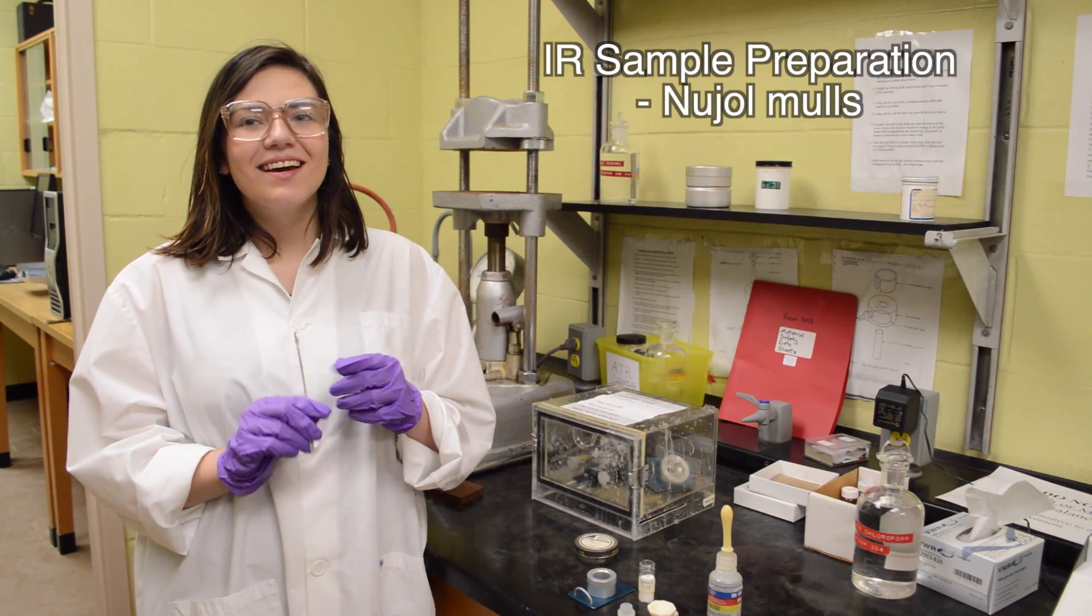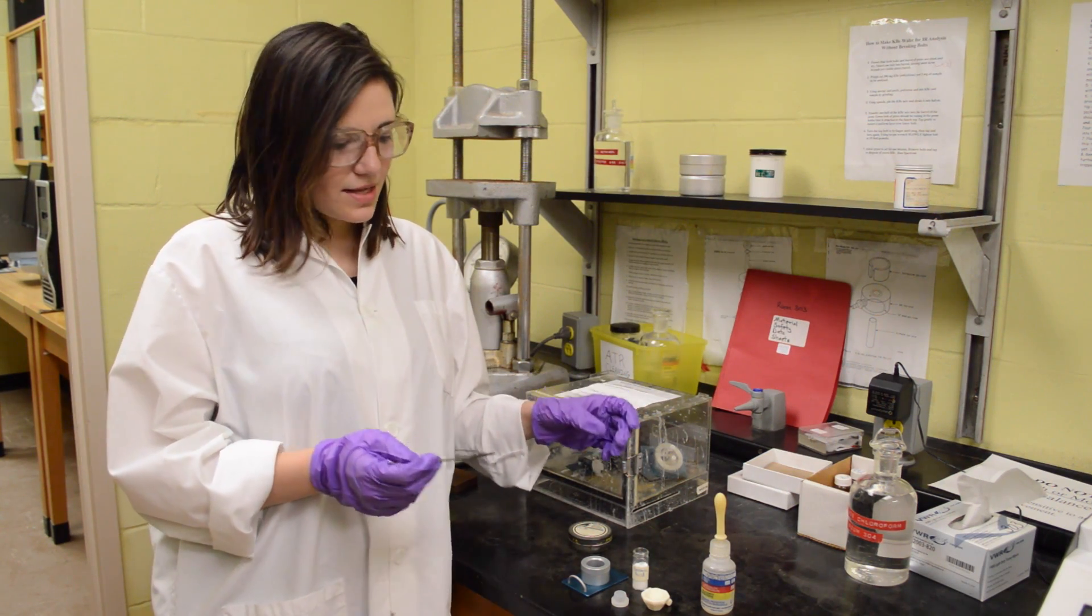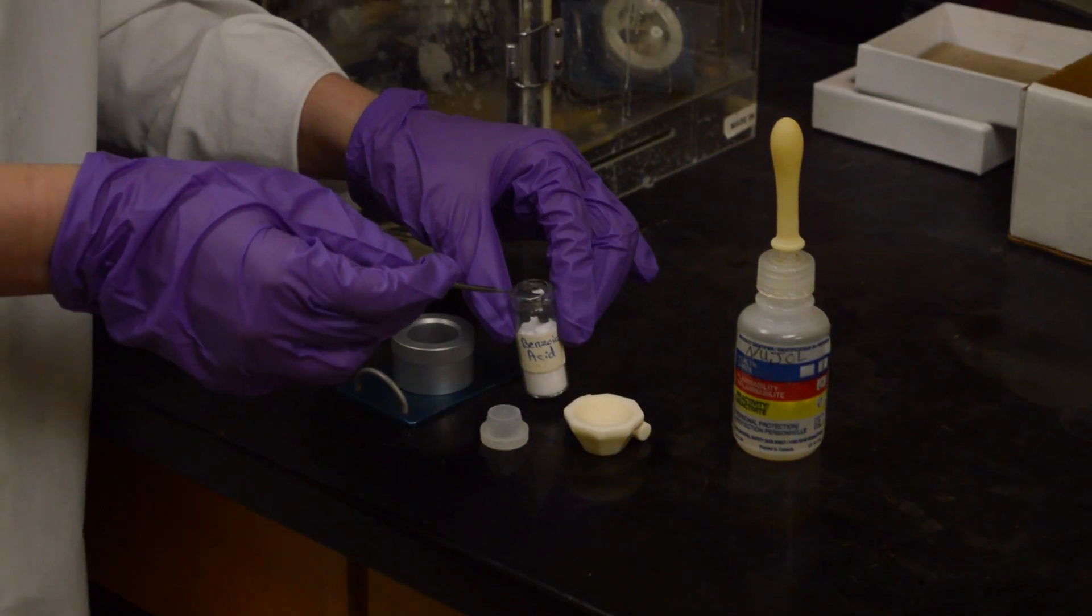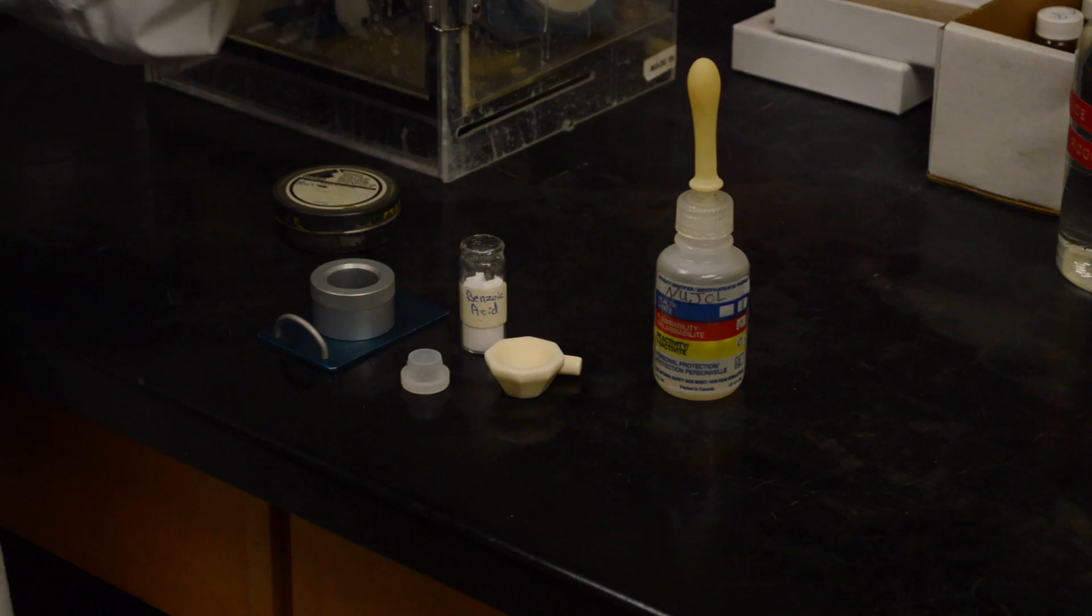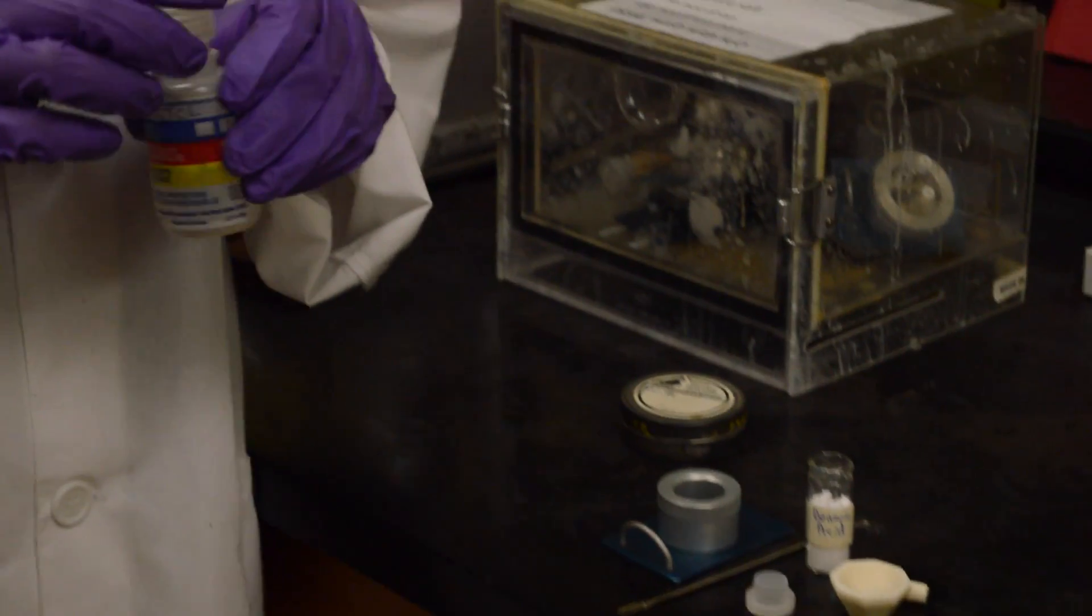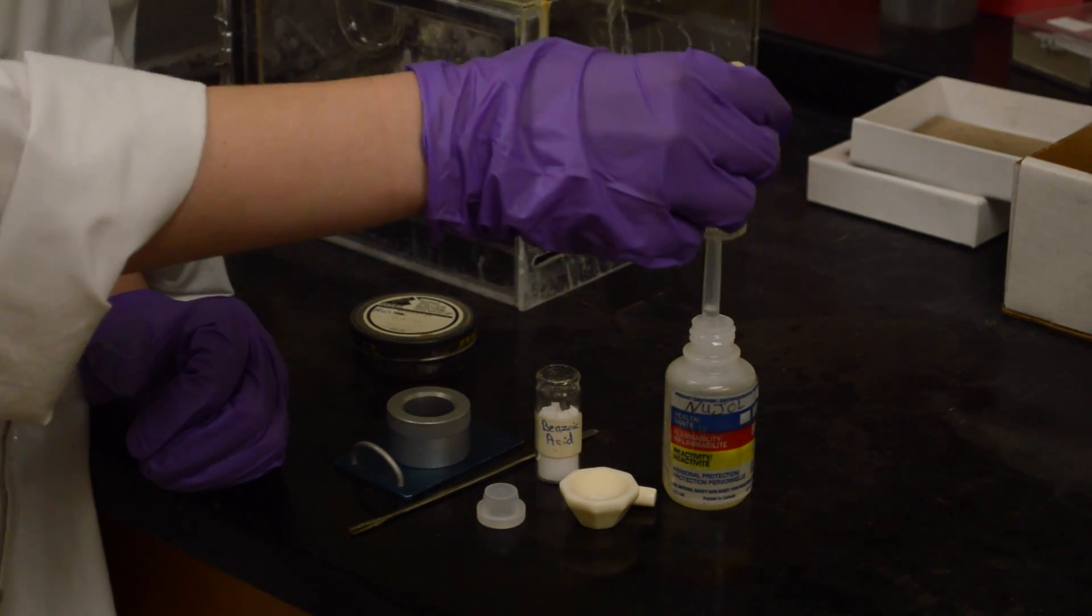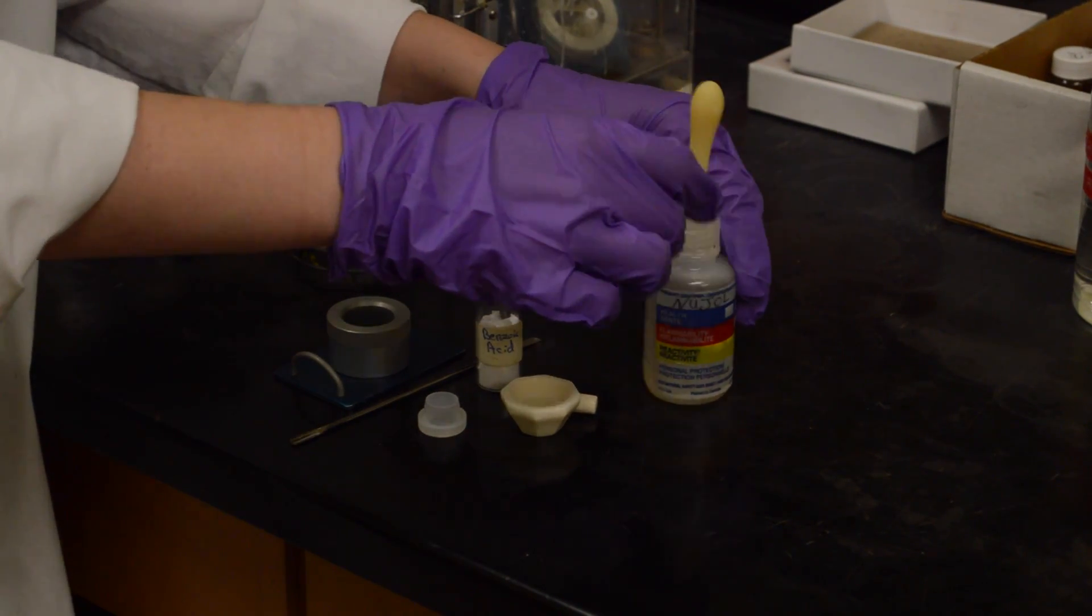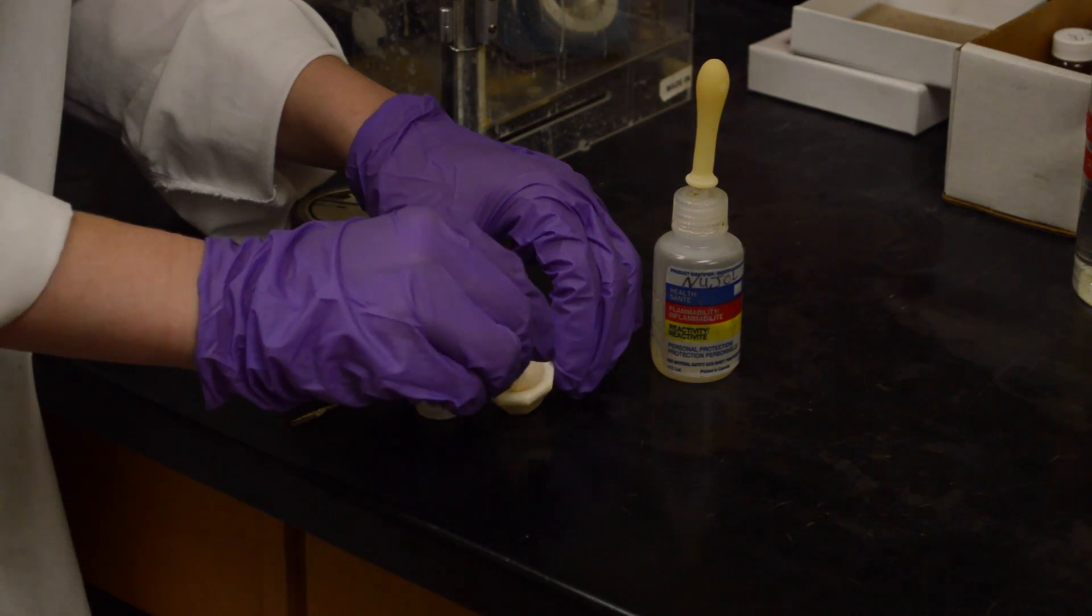I'm going to show you guys how to use the salt plates for IR on the machine that you were shown. If you have a solid sample, you're going to want to take a small amount from your sample vial and place it inside this tiny mortar and pestle like so. You want to make a paste with Nujol which acts as the background. Just take a couple of drops and place them right inside, and then mix it together.